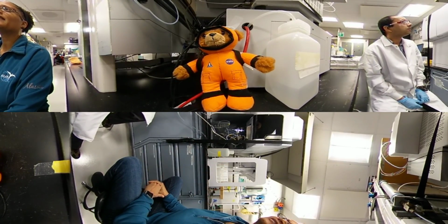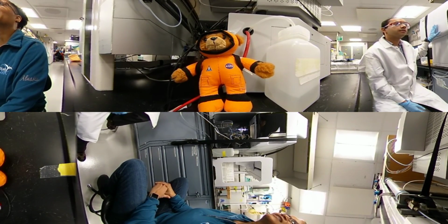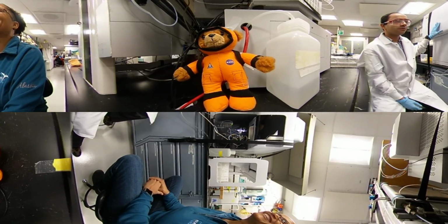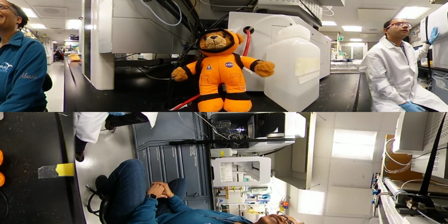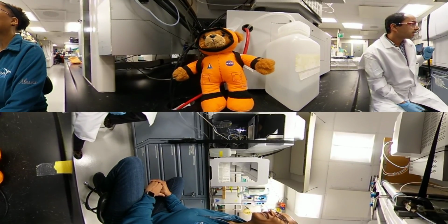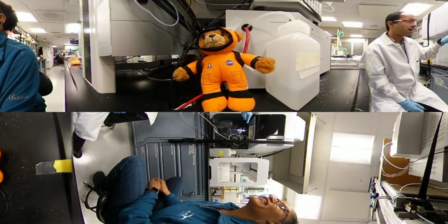Okay, so this is called ICP OES, which is inductively coupled plasma optical emission spectrophotometer. It's a mouthful, so we abbreviate it to ICP OES. This is one of the equipments which is very frequently used in inorganic geochemistry to measure different concentrations of different elements. So what you are seeing here is a lighted thing which is called the plasma.